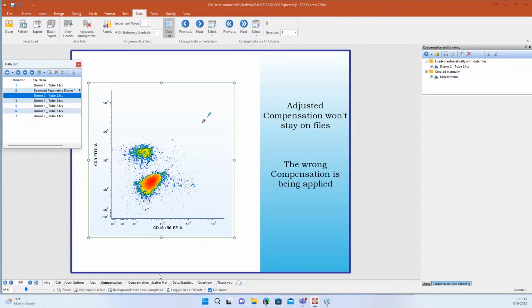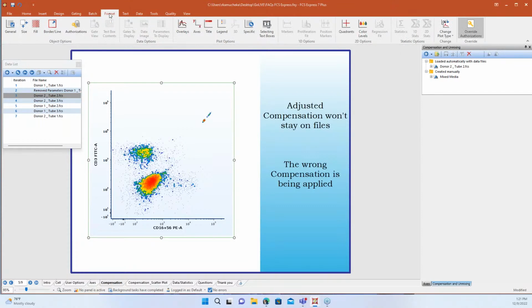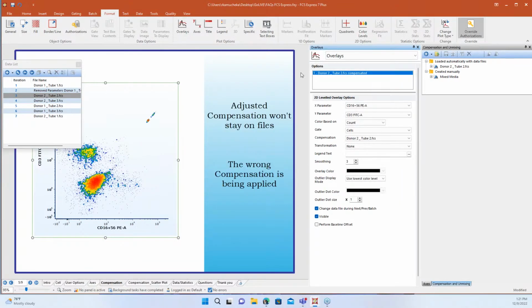Because you're right, this is usually where people think, oh, I didn't realize I had to make something a default. I didn't realize I had to do this because I'm using the comp from the instrument. But as soon as you make a change to it, it becomes manual, and so you just need to make sure you apply it correctly, and then it works pretty well. I love that. And then another place that you can see what compensation is being applied, if you're looking at your data and you're like, I don't think this is the right compensation, in our format window under overlays, it is going to tell you what compensation is being used.